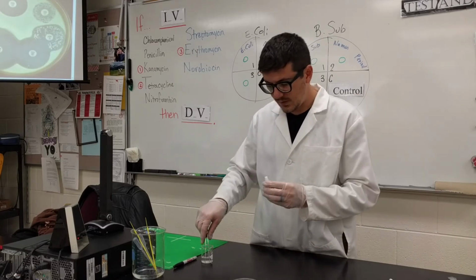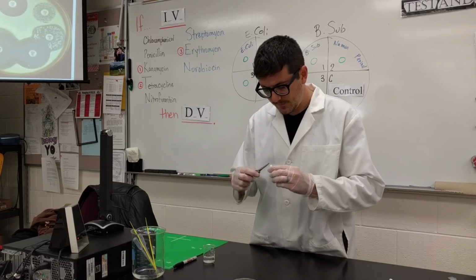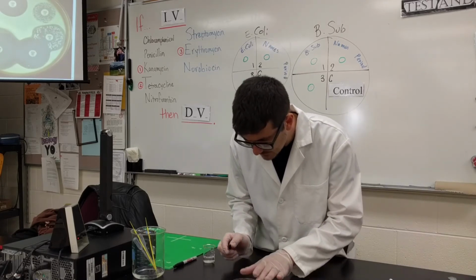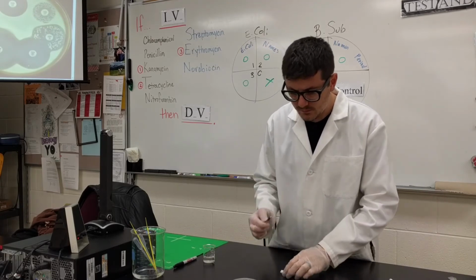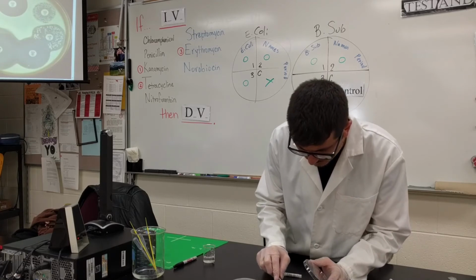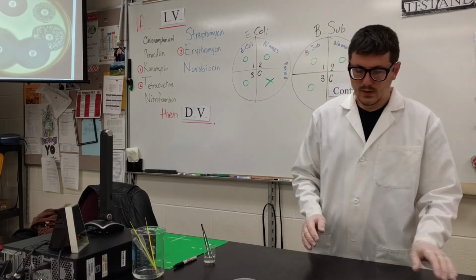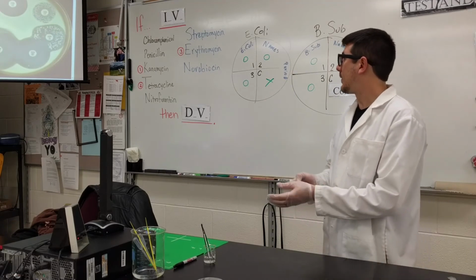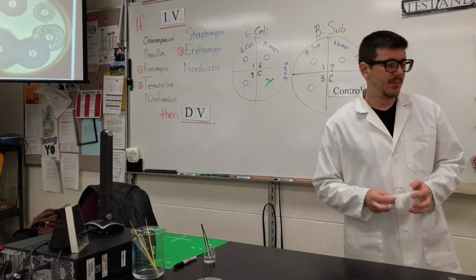Erythromycin, number 3. All right, we're gonna let them incubate overnight at body temperature now, 37 degrees Celsius. So we're good to go. Day 1 is done.